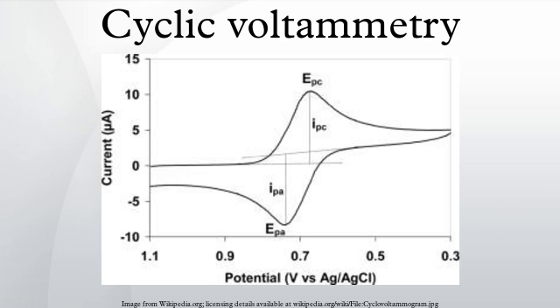Antioxidant capacity of red wines: the technique being evaluated uses voltammetric sensors combined in an electronic tongue to observe the antioxidant capacity in red wines. These electronic tongues consist of multiple sensing units like voltammetric sensors, which will have unique responses to certain compounds. This approach is optimal to use since samples of high complexity can be analyzed with high cross-selectivity. Thus, the sensors can be sensitive to pH and antioxidants.